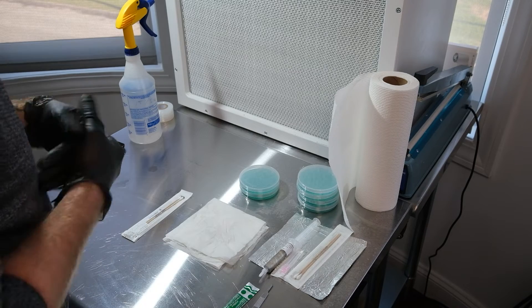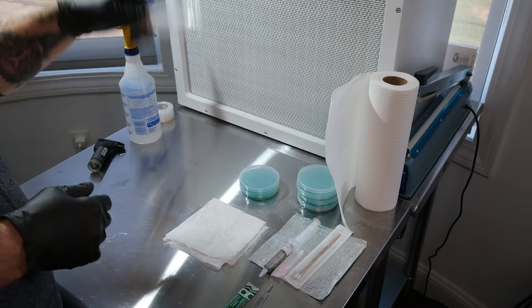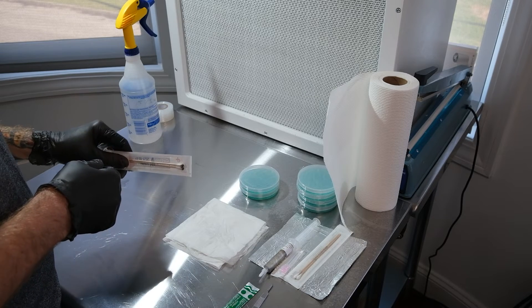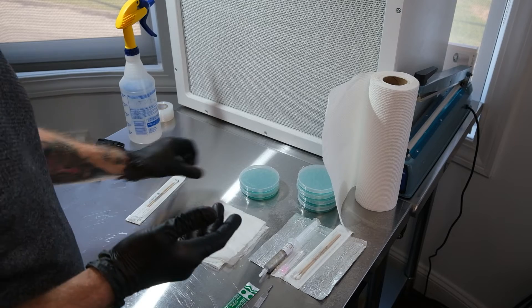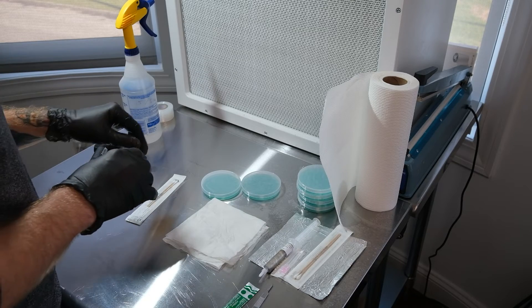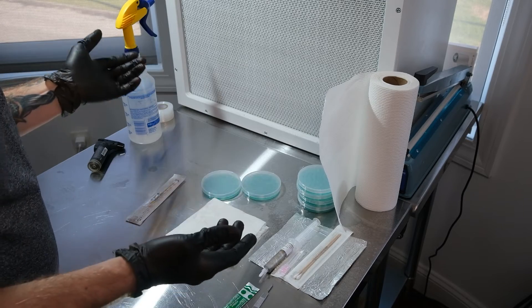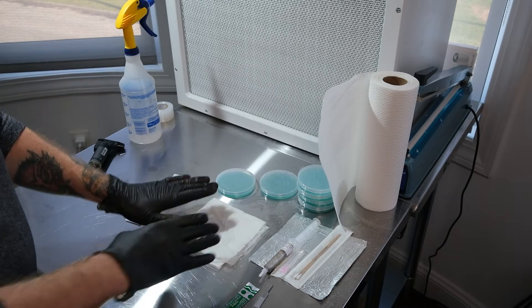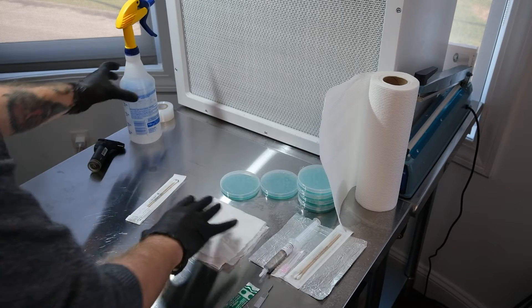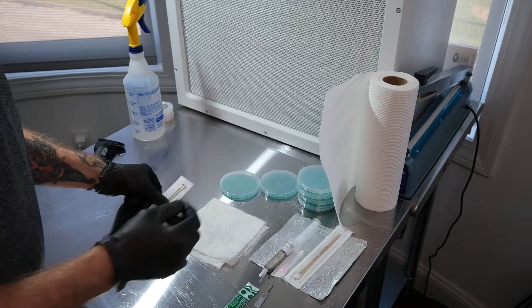Now that everything is cleaned, we'll start with the spore swab. You can find spore swabs on all kinds of websites. Swabs are great and very easy to use. One really important thing when working with agar: don't hover too much over the plate — things can easily fall in and contaminate it. I like to have an alcohol-soaked rag to rest the lid on when I take it off, so I know it's clean.